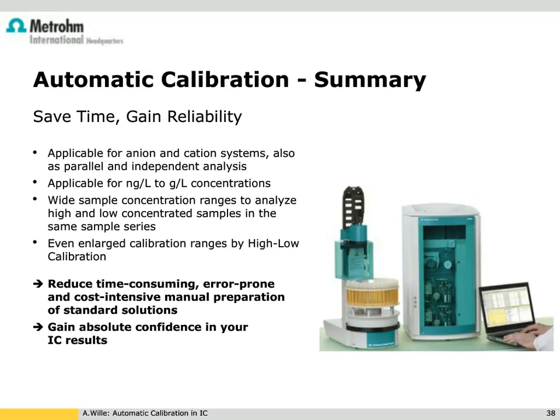So you compare the retention times with the known standard substance with the peaks in your unknown samples, and by that you identify here if it is in, let's say, a chloride or a sulfate. So it doesn't matter if it's single or double charged, you identify via the retention time.